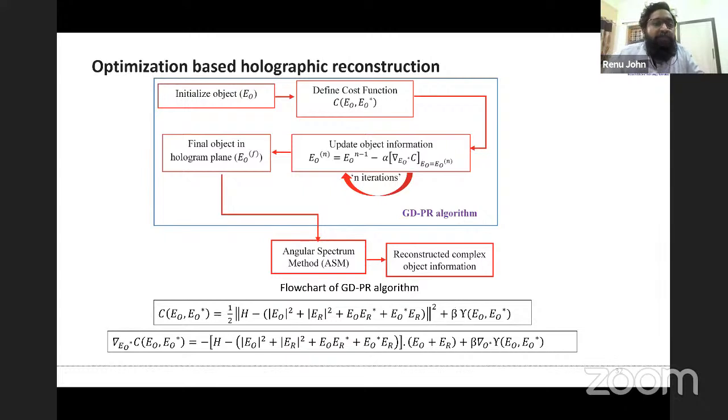So in principle, we can have a constrained optimization on the reconstruction, so that we can retrieve the object information which is overlapping in nature. We have some prior information also, because you know that it is a conjugate of the object, and you know what the ideal value is. So we can always take a reconstruction with the help of an optimization procedure.